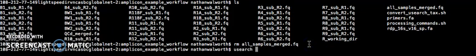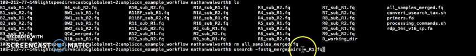So here's what the command looks like. We have usearch just as before, and we have fastq merge pairs. And here's where we denote that star and underscore r1.fq. So notice before we just had a single file name underscore r1.fq. With the wildcard, we can say grab all of the files with r1.fq.